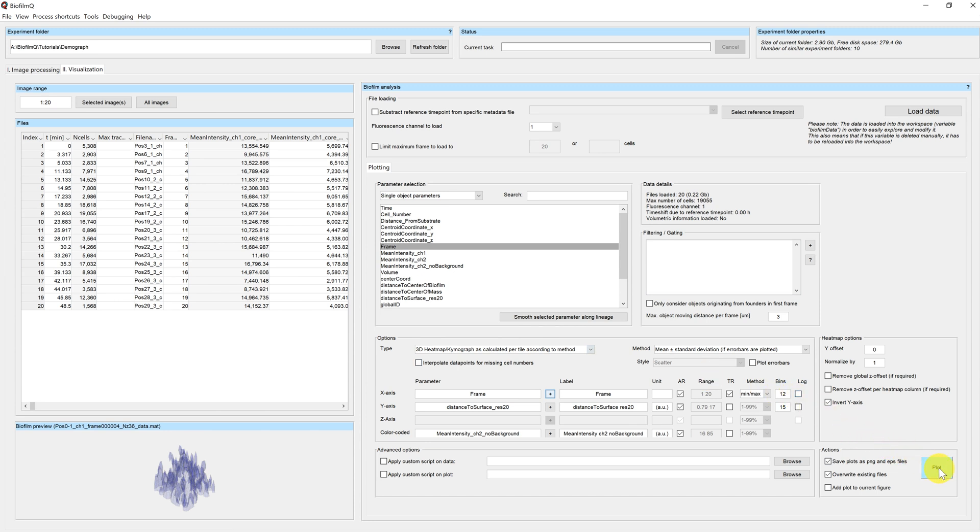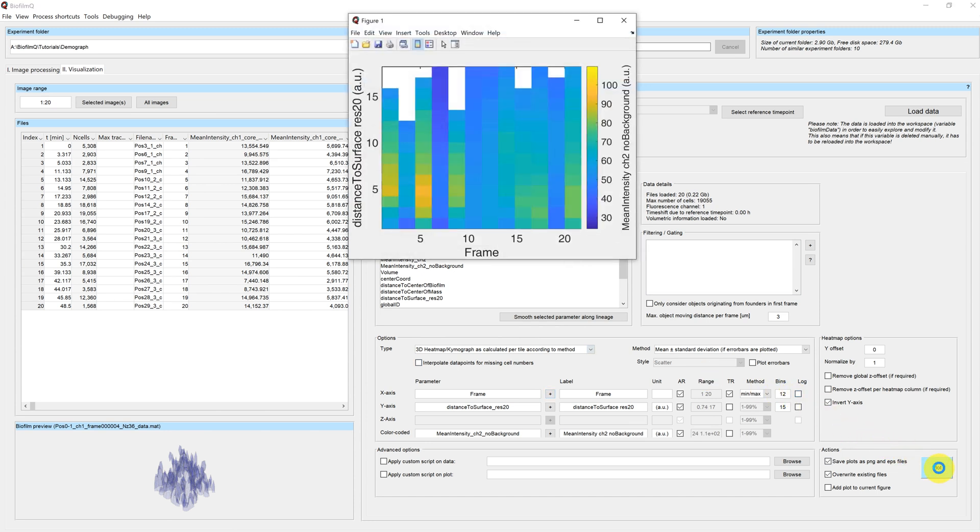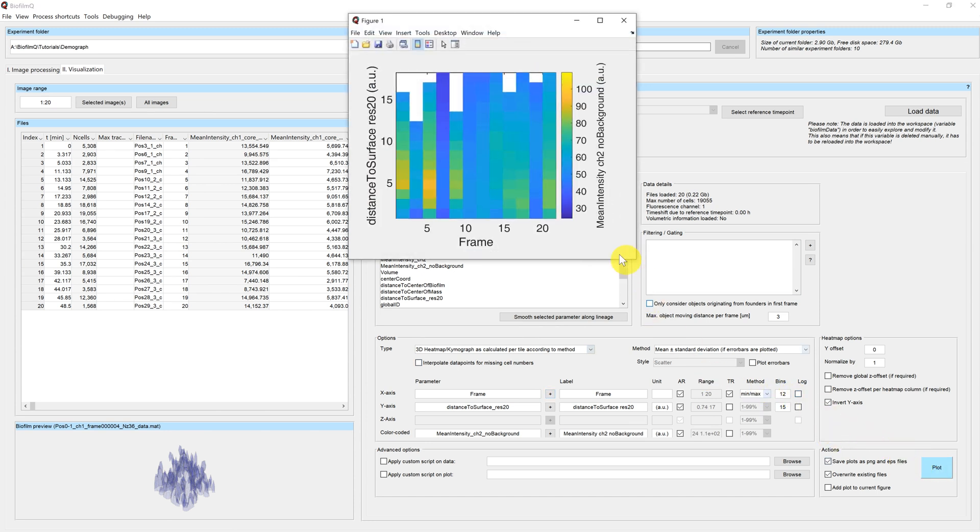Again, we perform the plotting with these same settings as before, and you can see that now each column represents one biofilm.